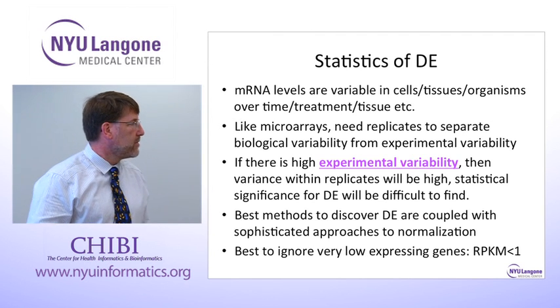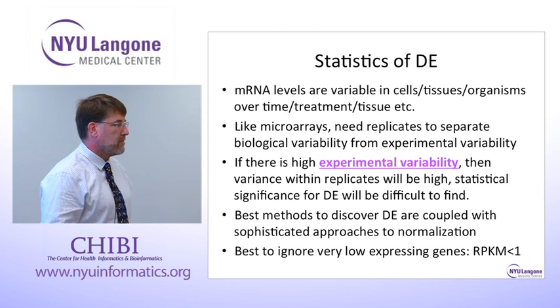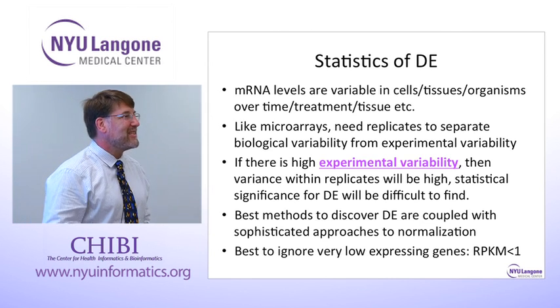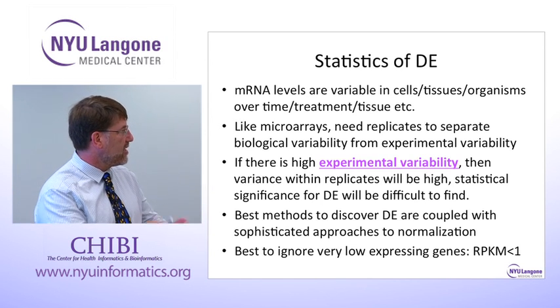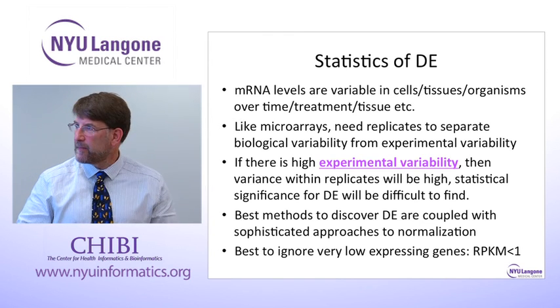In your first plot, you had a very impressive correlation. Do you know how they did the calculation for that? Illumina internal data. They did it so it came out good, I think, is their answer. And they also did it on a finite number of genes because they were qPCRing, so they probably did like 500 genes.